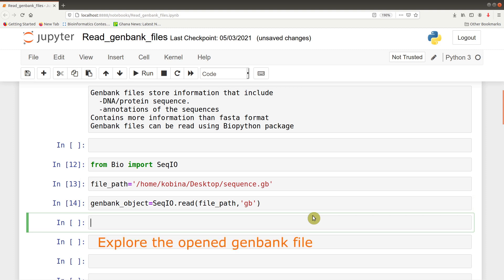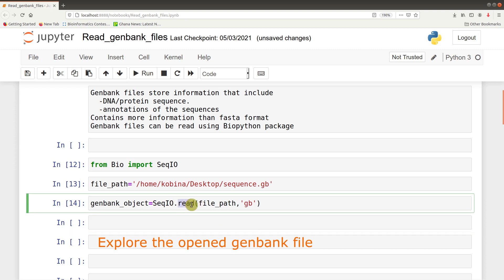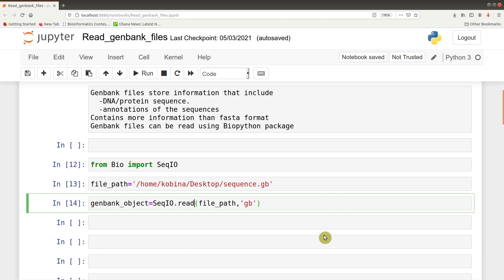Now that we have the object read, it's time to explore. We are using .read because GenBank files usually contain one record. If it's multiple records, we use .parse instead, but that will be for another video.